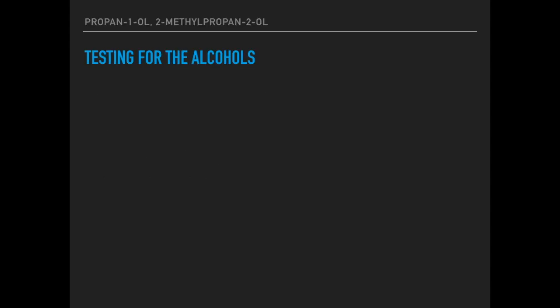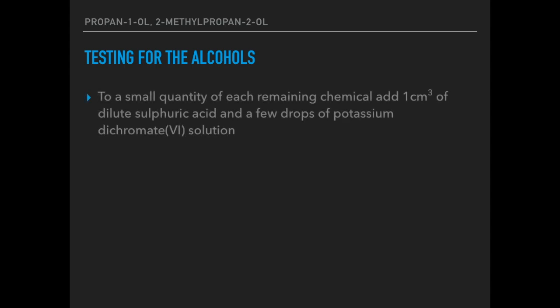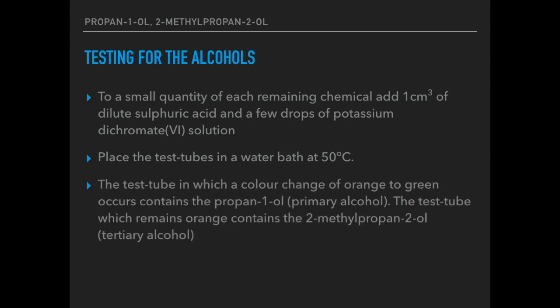We're down to just 2 alcohols now: a primary one, propan-1-ol, and a tertiary one, 2-methylpropan-2-ol. To a small quantity of the remaining chemicals, add 1 cm³ of dilute sulfuric acid and a few drops of potassium dichromate(VI) solution — acidified potassium dichromate. It's important to specify dilute sulfuric acid. Place the test tubes in a water bath at 50°C. The test tube in which you get a colour change from orange to green must be the primary alcohol, propan-1-ol.